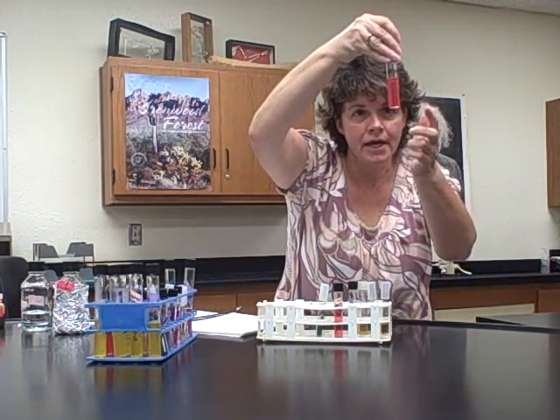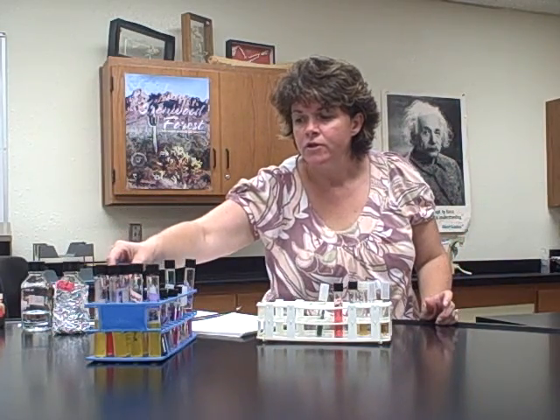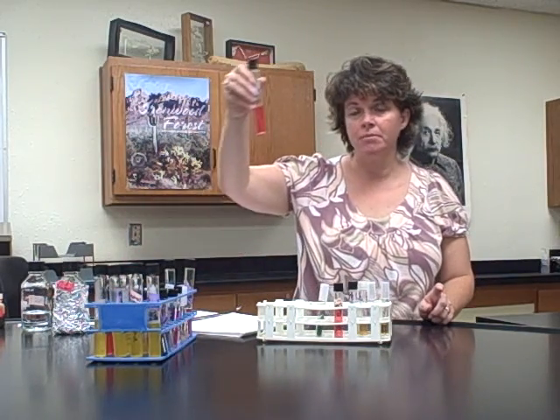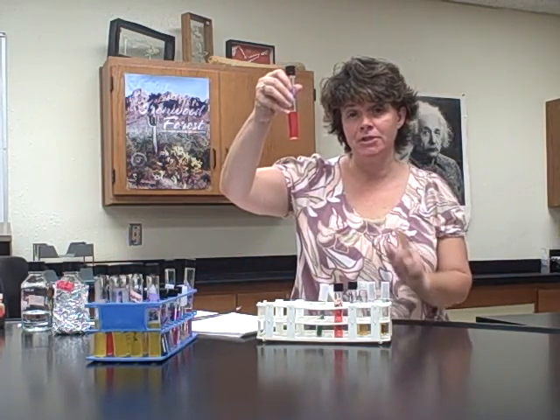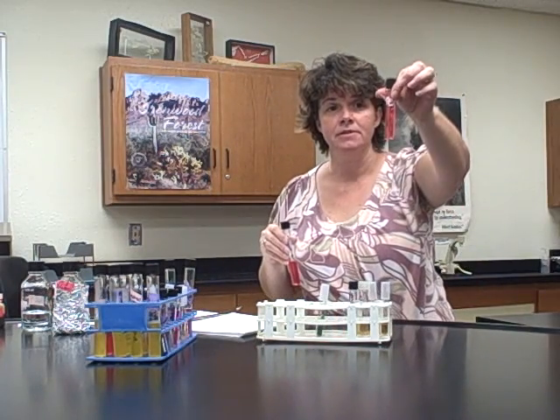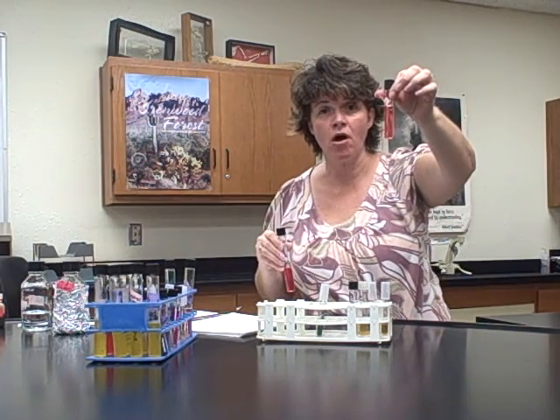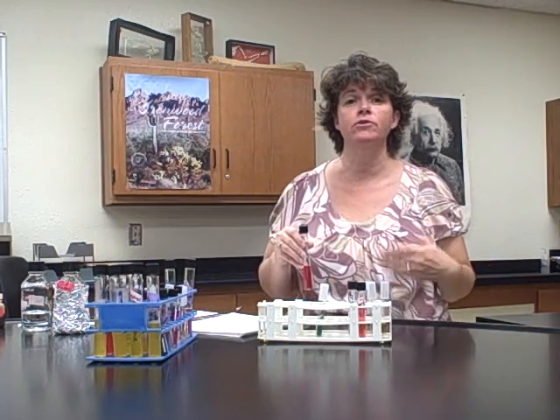So give it a little tap. It's slightly cloudy, so there's very little growth. The reason that you have to check for growth first is because I can't interpret the results as being positive or negative until I make sure there's growth first, okay? If I see something like this and I say, oh, it's negative for lactose fermentation, well, that's wrong because actually it was no growth. So I have no determining factor of whether or not that bacteria is positive or negative.